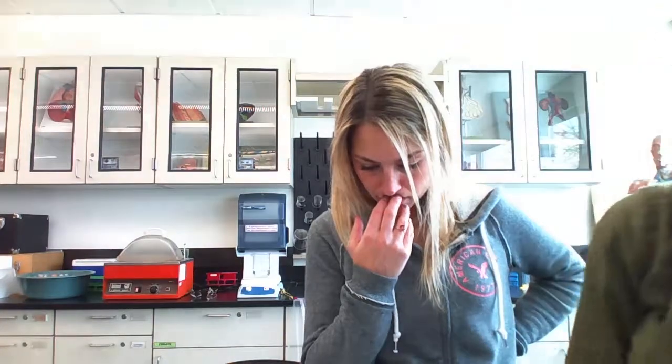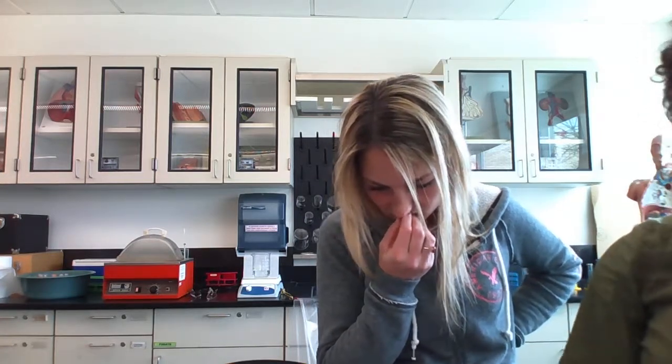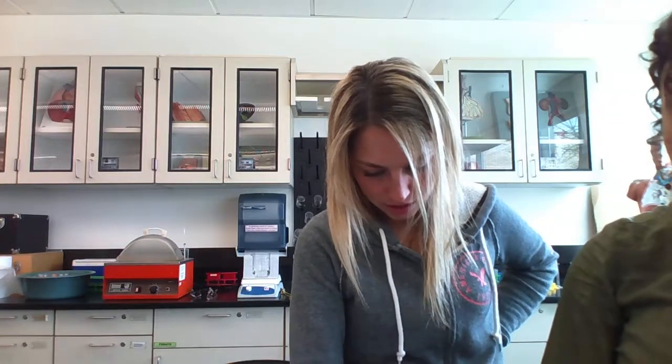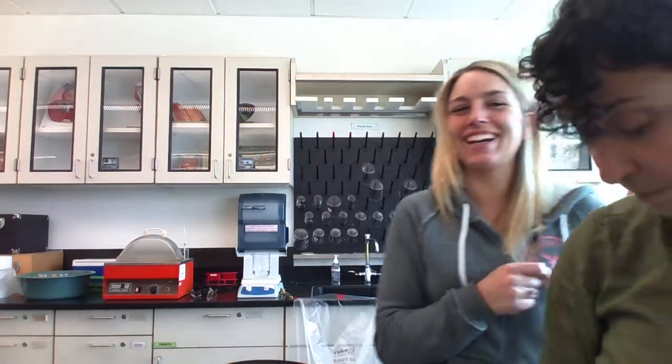Okay. And then do we know what we're looking for on each of these, to be able to tell if it's broken down? There should be no color change in either of those. No color change here. Which one of you wants to do it? I'll do it.